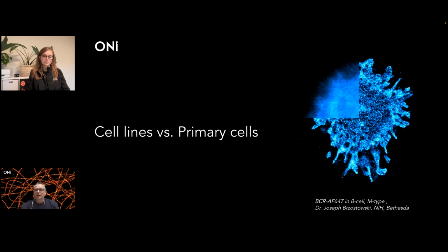A 1.5 cover slip can work if you are really looking at the bottom part of your cells. However, if you want to go deeper inside the cell, let's say a 5 micron thick cell, like macrophages, which have a big nucleus, and you want to go further in, then you might be at the edge of the detection of your system. Or if you are using slides for histology, you can actually place your cells on those slides if you are interested in that.